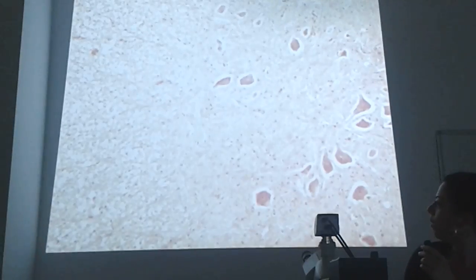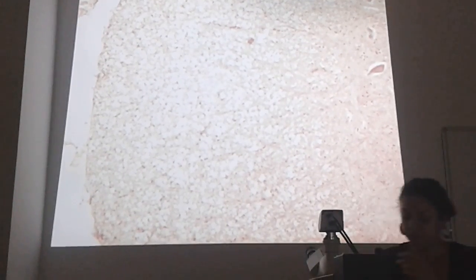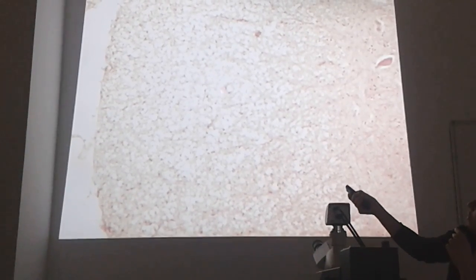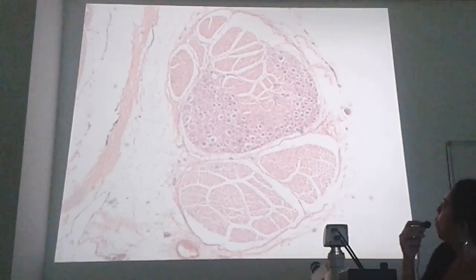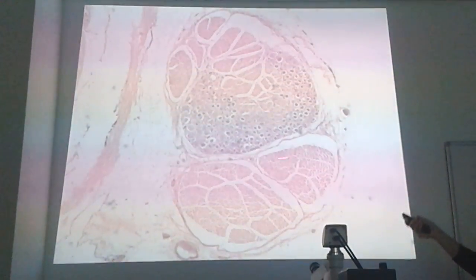And if we look at the white matter of the medulla spinalis, all you have to see is some axons, dendrites, and also some glial cell nucleus. See, glial cell nucleus and lots of axons and dendrites can be seen in the white matter. In your medulla spinalis slide, you will see another distinctive structure, which is the dorsal root ganglia. So this is the dorsal root ganglia.